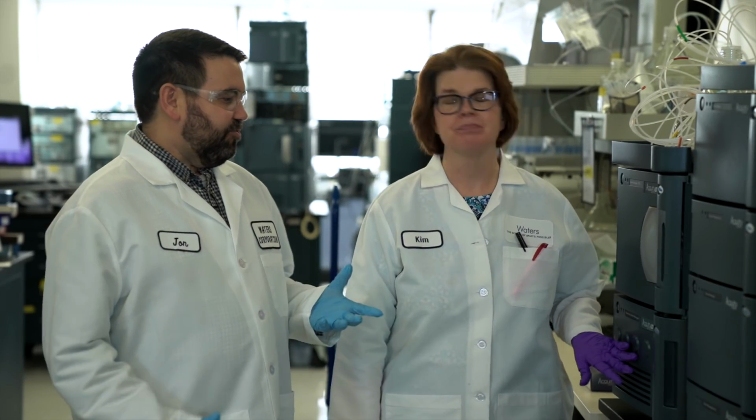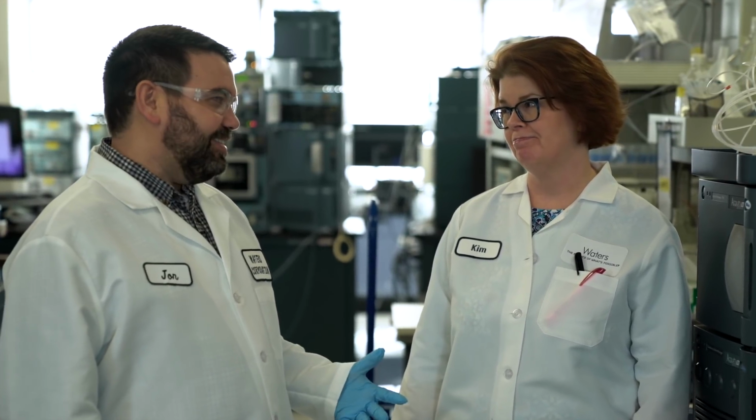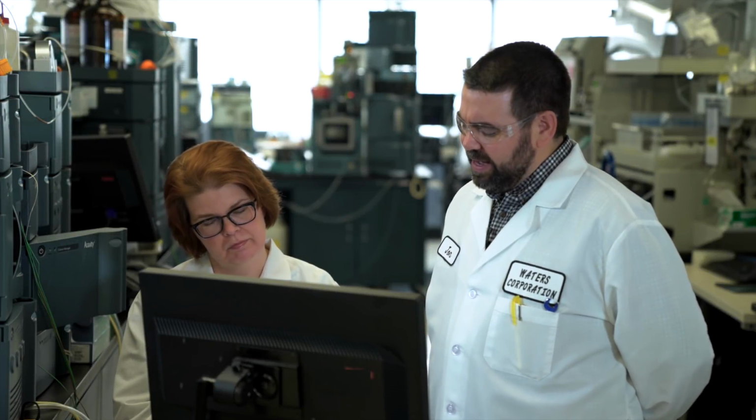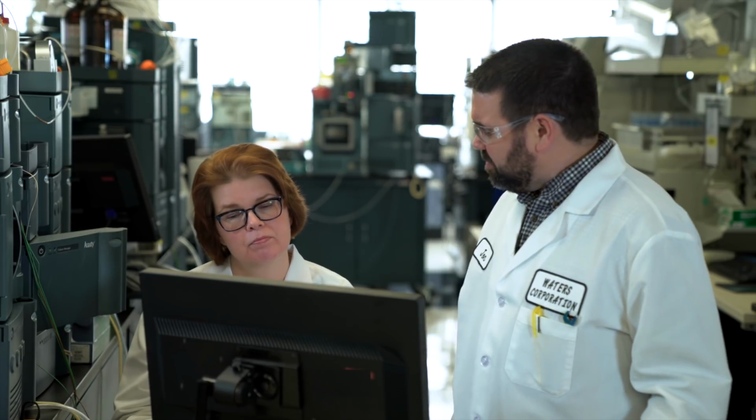All right, Kim, that was a pretty straightforward set of experiments. We just ran the same columns under the same conditions. That's probably the most boring experiment I've ever done in my life, but we needed the data, so we had to do it. Yeah. So getting back to looking at the results from percent carbon and overall retentivity, we ran a bunch of columns and were able to track the overall retentivity of those columns. How does the data look?